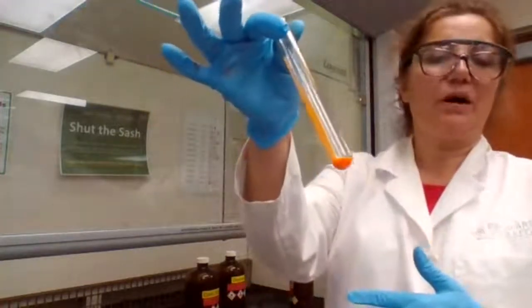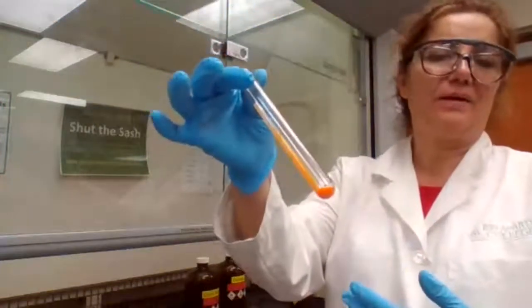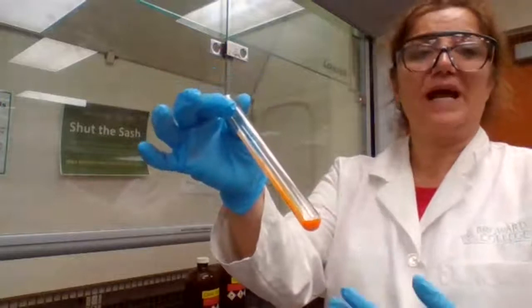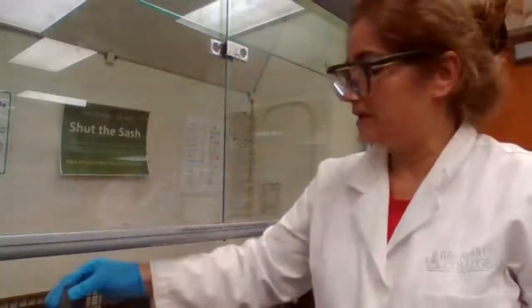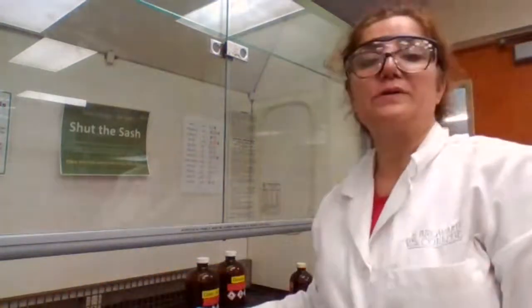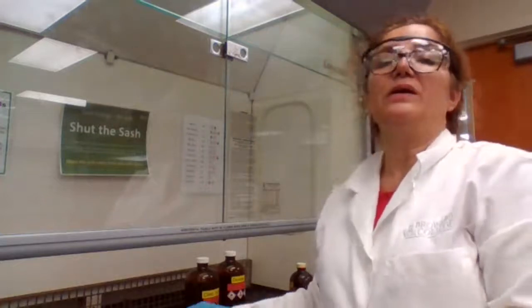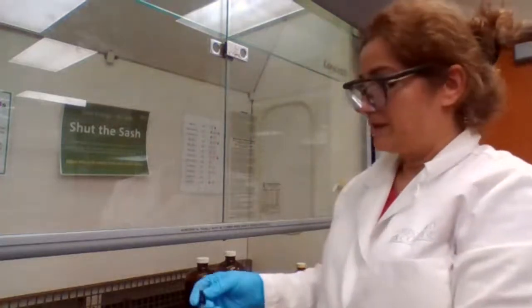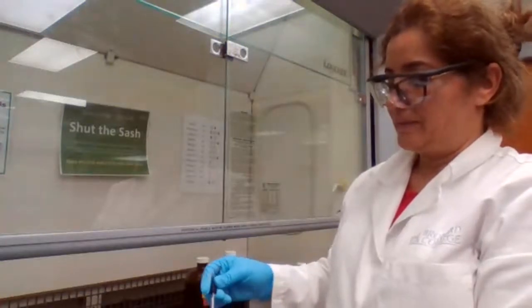And we did the hot water bath. If 2 or 3 of them don't react, then we use hot water. If one doesn't react, we know that one of the unknowns is water at this point. That was A, yes. So for A, you are going to put plus or positive. That means the reaction actually took place.